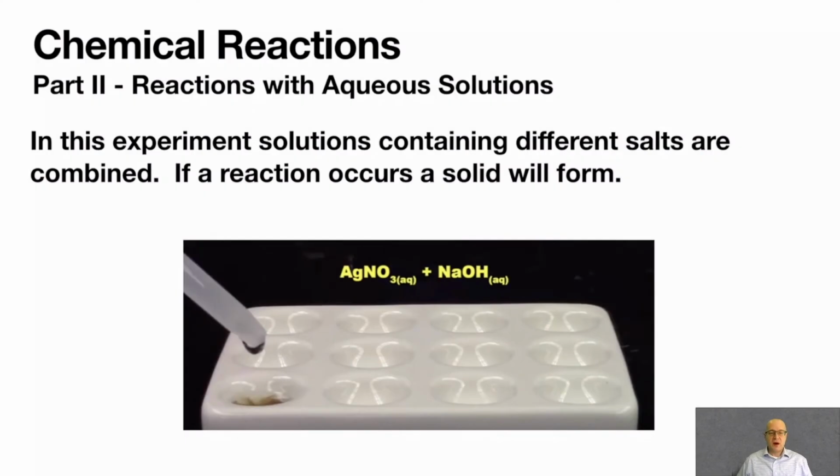Part 2, reactions with aqueous solutions. Now, when reacting with aqueous solutions, we're looking for, generally speaking, solid formation. There could be heat as well, or the loss of heat. But in this particular part of the experiment, we're literally just looking for solid formation.